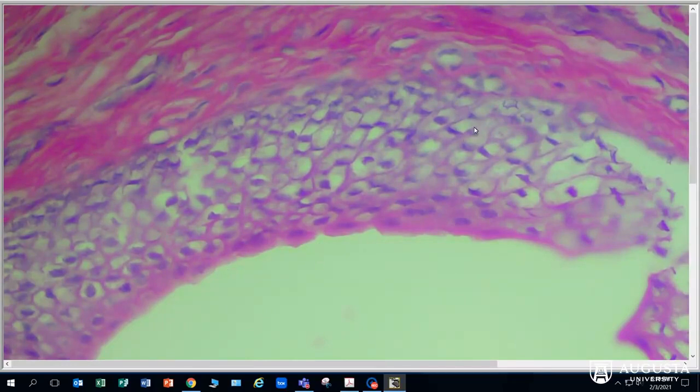Notice how we have this enormous cell with a very rectangular, flat nucleus. The purpose of this cell is to be able to stretch. So imagine that this tissue is found in your urinary bladder. When your bladder is empty, the tissue can be relaxed. When the bladder is full, the tissue needs to be able to stretch without ripping.